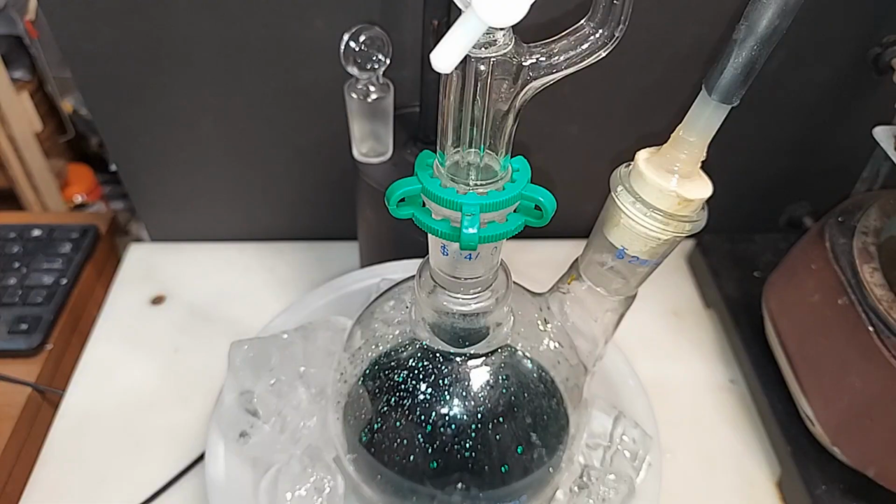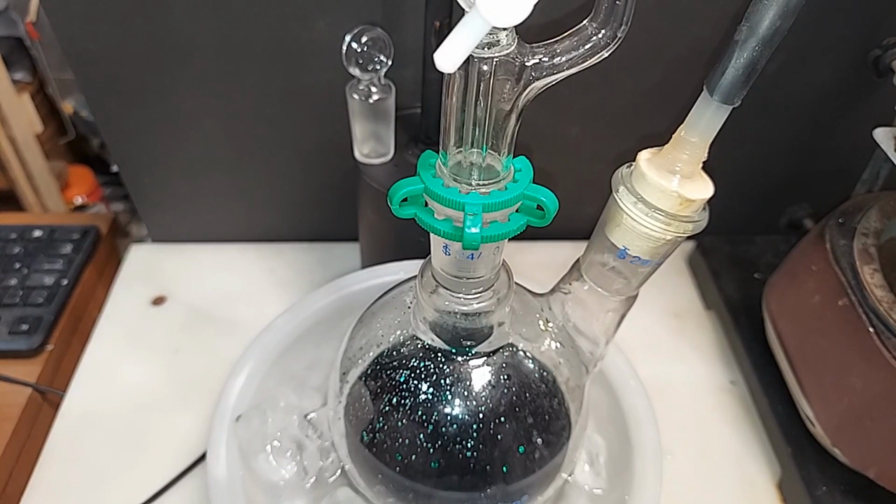With the addition of the methanol, the chromium is now in the +3 state, and that's a green color. So it will remain green from here on out as we reduce the chromium and we oxidize the methanol. Things are going well. There's probably only 5 milliliters left of the methanol. That'll finally drip through, of course. I don't think a lot's going to change here, so I'll just be back when it's done.